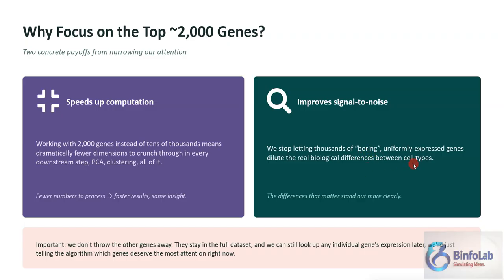So why not remove them, and focus on those genes which are highly variable, as compared to those so-called boring genes or housekeeping genes? The differences that matter stand out more clearly.